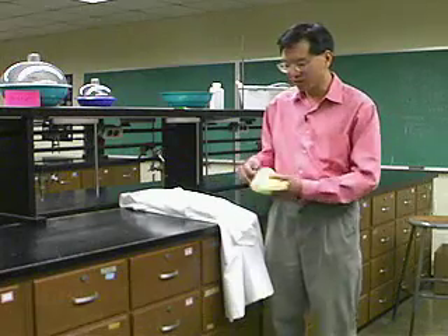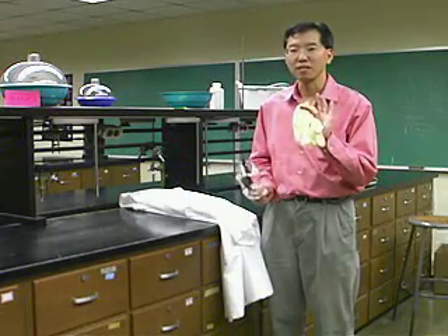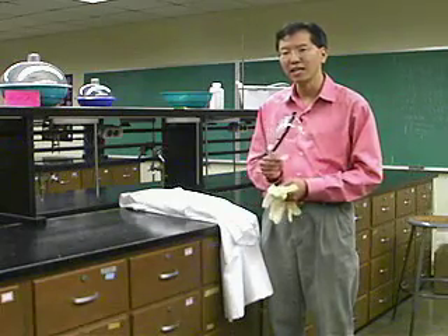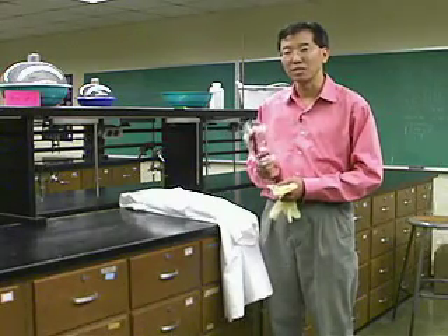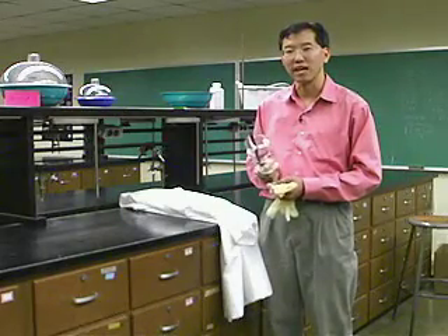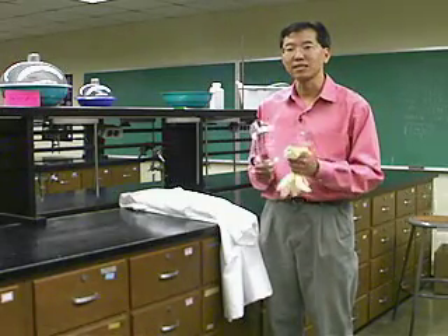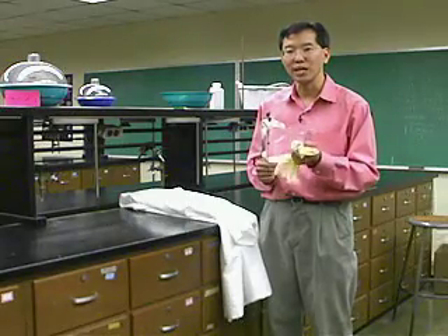But in the laboratory you're always going to wear these goggles. And you might want to wear plastic gloves or rubber gloves if you're working with things that are going to burn your skin. Now, the other thing about our laboratory demos is that we're almost always working with very innocuous compounds — things like food coloring and sugar and salt. Those things are not dangerous, but the key is that we're aware of the dangers because we're trained scientists. You're just developing as scientists, so you need to pay particular attention and be aware of what's going on.